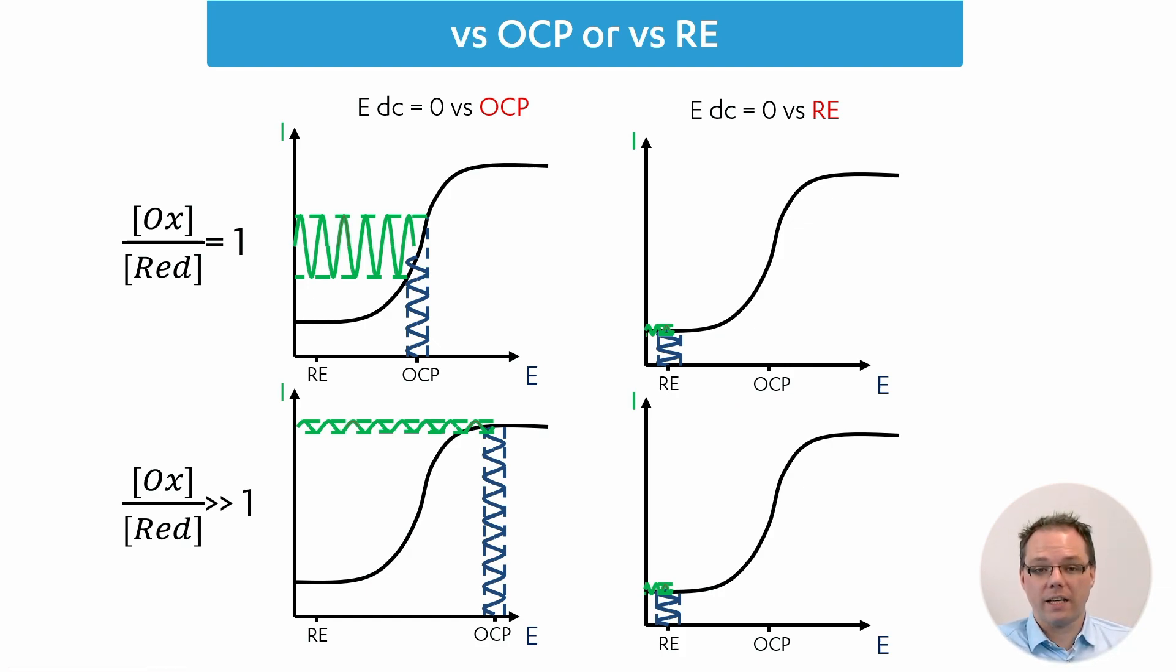Plus we have pulled away the working electrode from its OCP to the RE's potential, so we also have in the background a reaction running now. If your solution has a very different ratio, measuring versus OCP would put you at a different place where you might get a bad signal. If you apply zero volts versus a reference electrode and you have a proper reference electrode, the potential will not be influenced by the concentrations in solution. This is a rather common mistake that people apply zero volts versus their reference electrode, pulling the working electrode from its OCP to the reference electrode's potential.